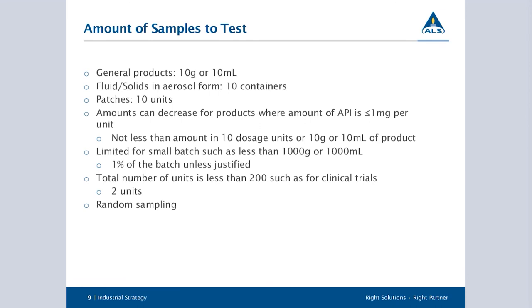Organisms are not homogeneous throughout batches, especially in lotions or shampoos, thick viscous products. So it is very important to sample for testing at the beginning, middle, or end of the manufacturing line, or the top, middle, and bottom of the tanks.